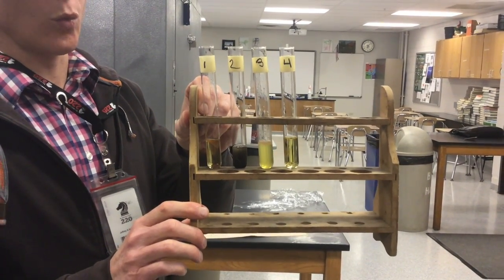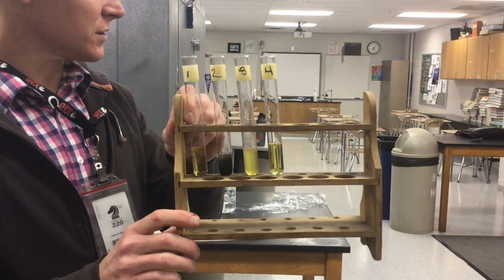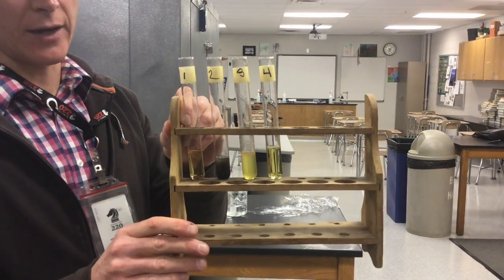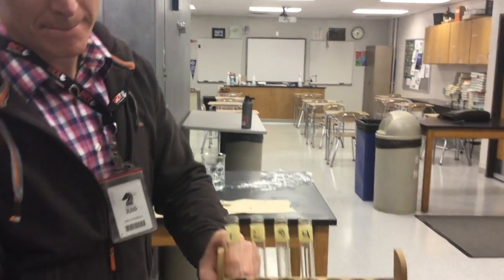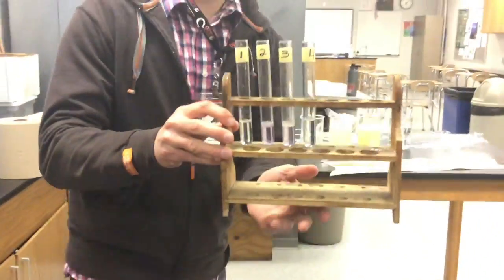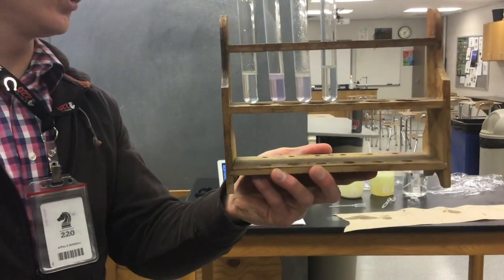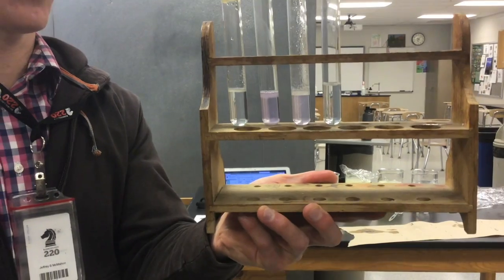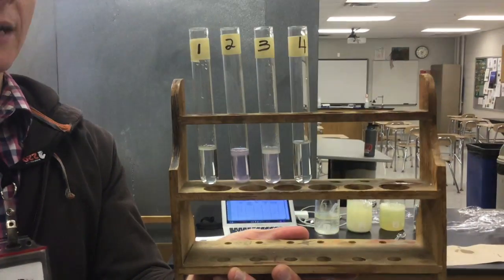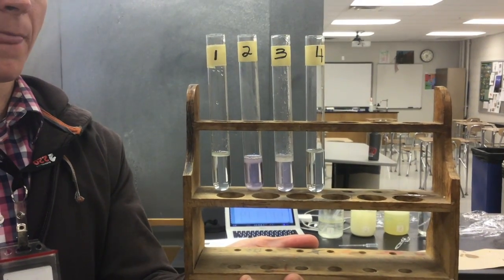All right. So one of these unknowns is positive for starches, which is long-chain carbohydrates, and 3 of them are negative for starches. Okay. All right, for the Biuret test, we can see that we have some, remember Biuret is testing for proteins. 2 of these are testing positive for proteins. That's when you see that purple color. And 2 of these are testing negative for proteins, so not in the unknown.